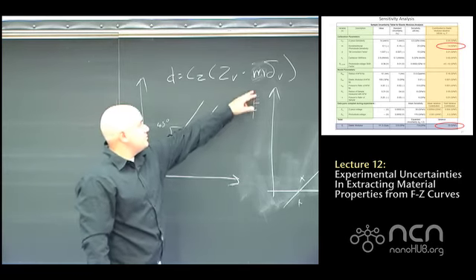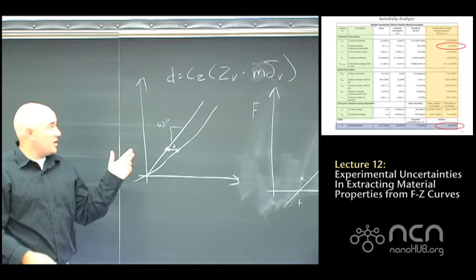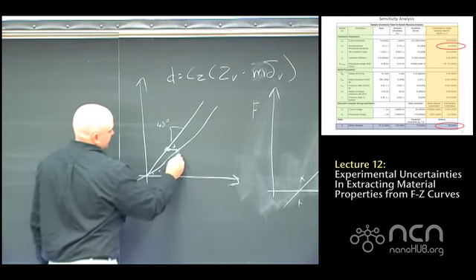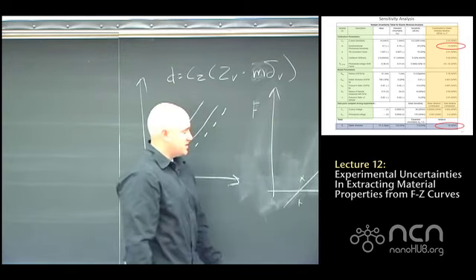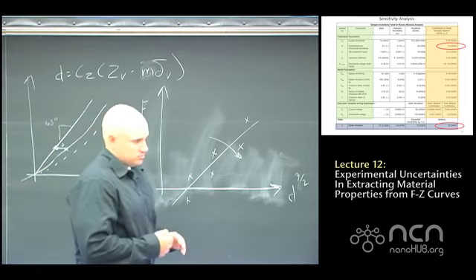And then in terms of calibration, M changes all values of delta V independently of Z_V. So that causes this entire curve to shift like this, which shifts our entire slope of this curve. And if you think back, I said basically E was more or less proportional to the slope. So it turns out that because of the way we set up the calibration, M is the dominant contributor to uncertainty. So that's more or less the entire lecture I had planned out.